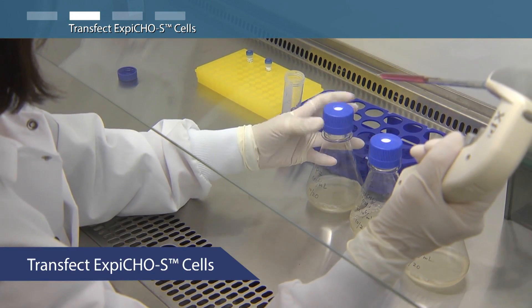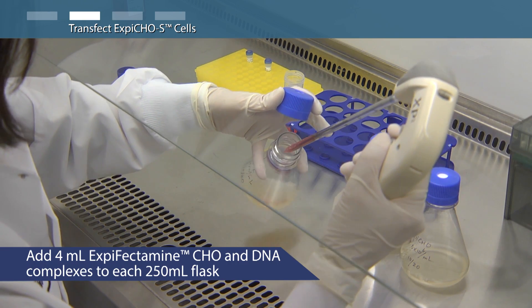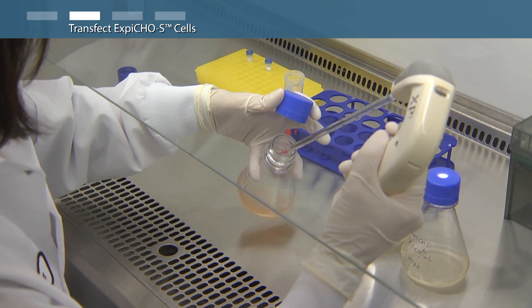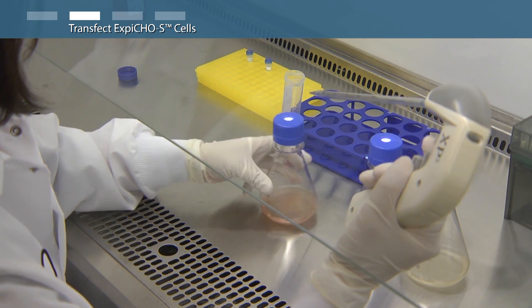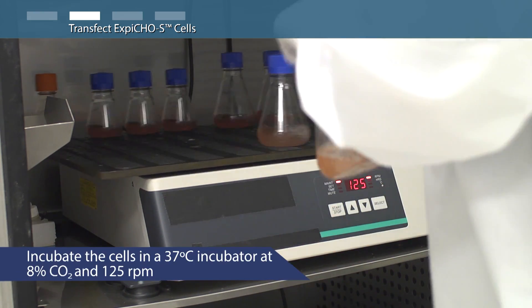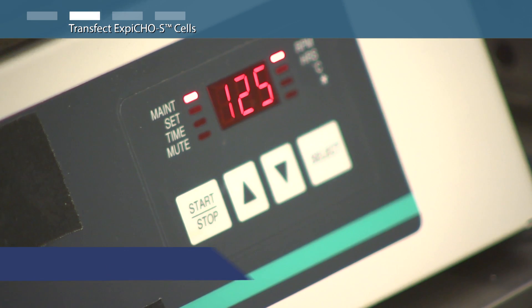Incubate the XBFectamine and plasmid DNA complexes at room temperature for up to 5 minutes. Then slowly transfer 4 milliliters of solution to each of the shaker flasks, swirling the flask gently during addition. Do not allow the complex to incubate for longer than 10 minutes before addition. Incubate the cells at 37 degrees Celsius with 8% carbon dioxide and shaking.